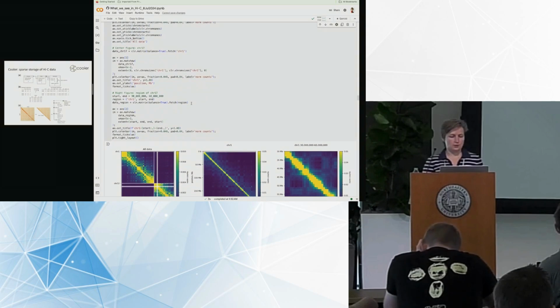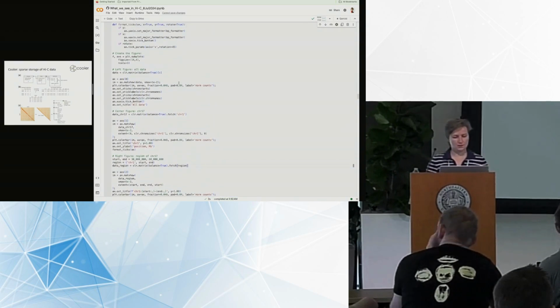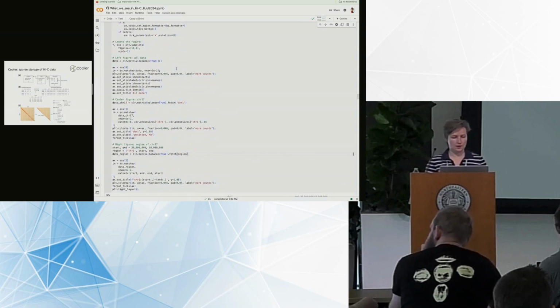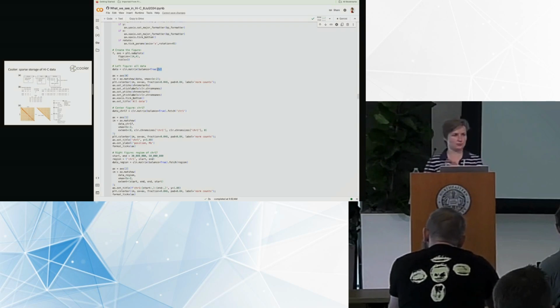A little note on how we did that in the code. When I was loading the IC matrix, when I load the whole dataset, I specified matrix and load everything. So basically this double dot means load the full dataset. If you're loading your dataset at 1 kb resolution, I do not recommend using it because it will overload your memory. So do not use it without thinking.